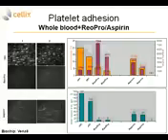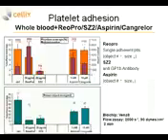In the case of aspirin, you can see a slightly different image, where there's still quite a lot of coverage by the aggregates, but the overall number of objects is increased. And this is also proven if you look at the mean object area. In the case of the non-treated control sample, there is quite a big object mean area. In the case of ReoPro, you have only single platelets or several platelets attached together. In the case of aspirin, the area of individual aggregates is reduced.